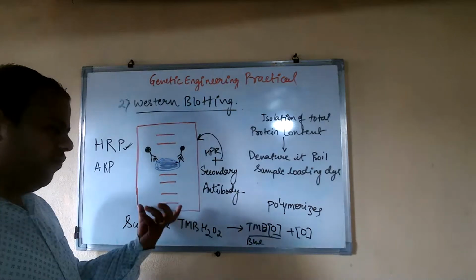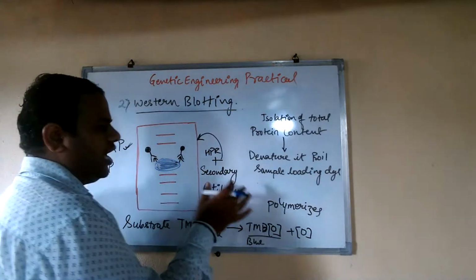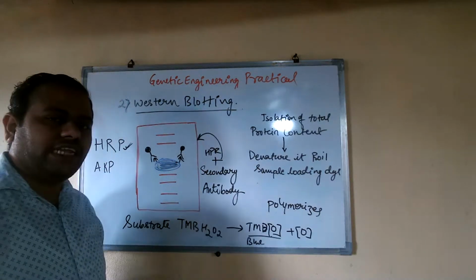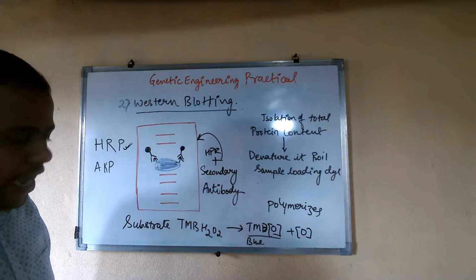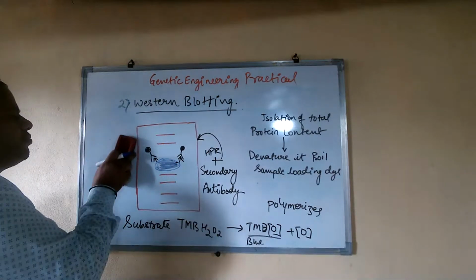We have taken one well for detection, and now we are going to compare this nylon membrane with the extra well that we took at the starting. Okay, so from that we can compare.